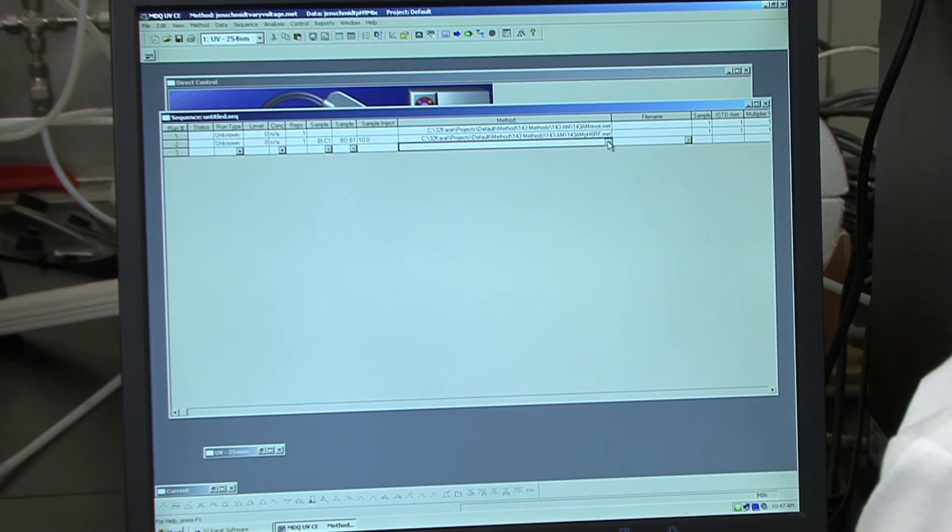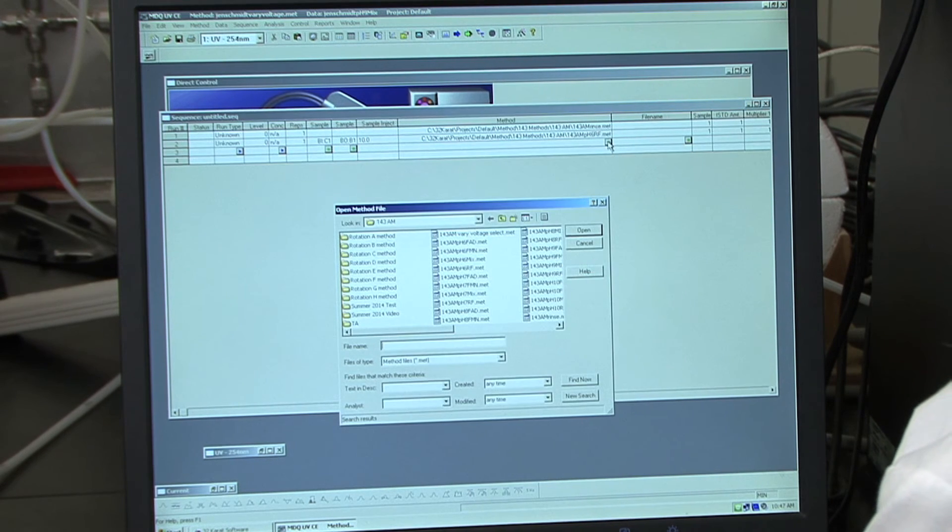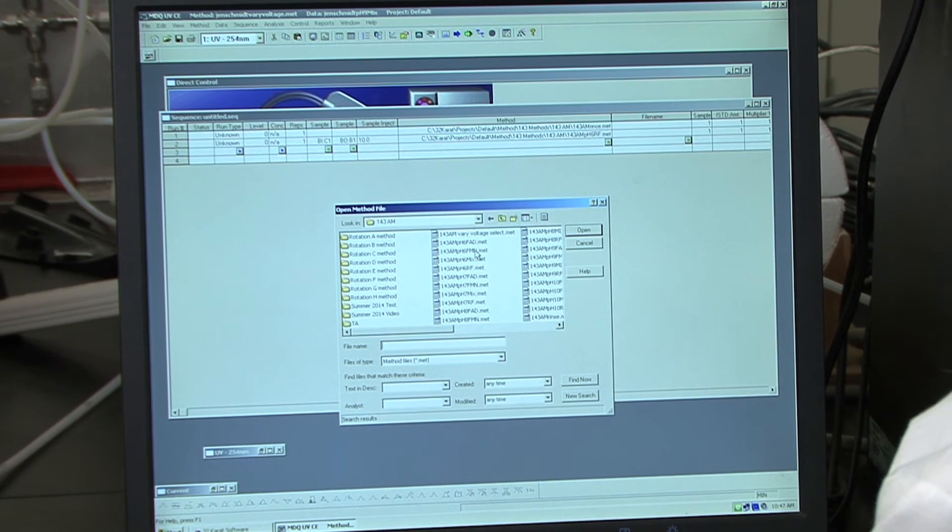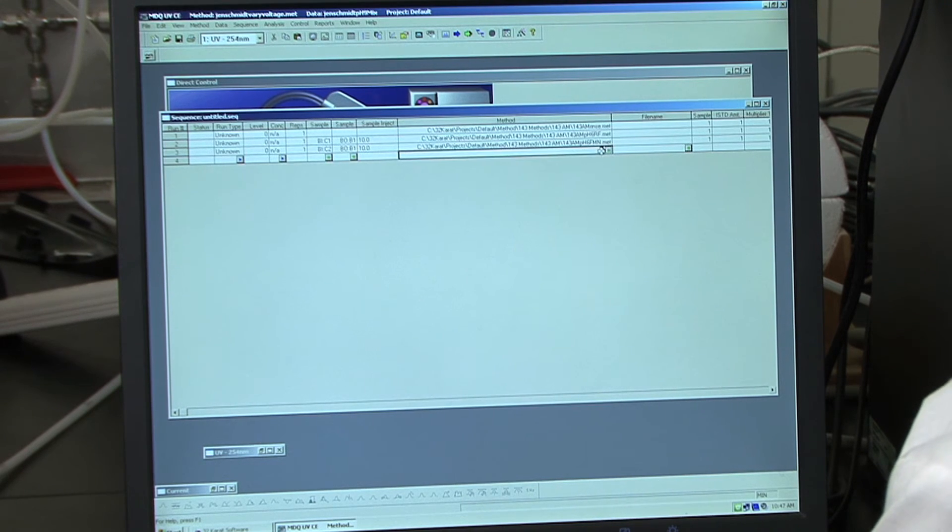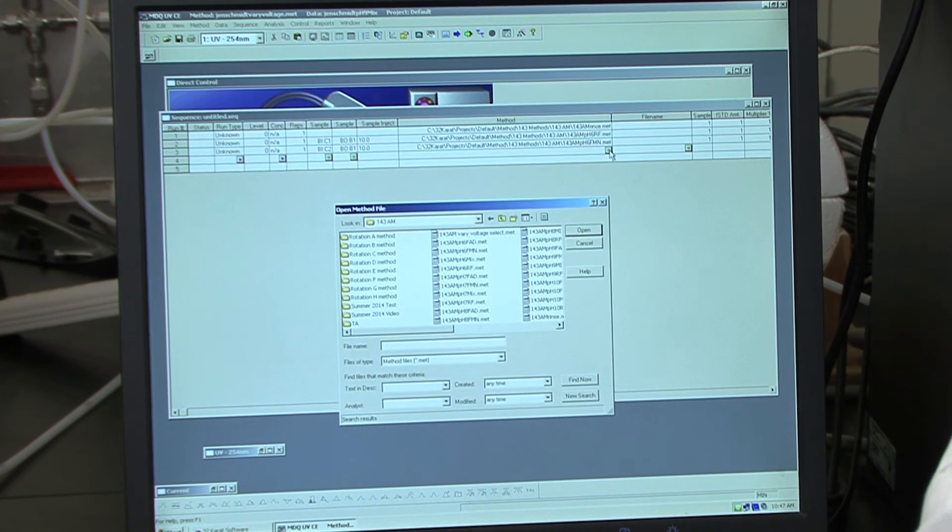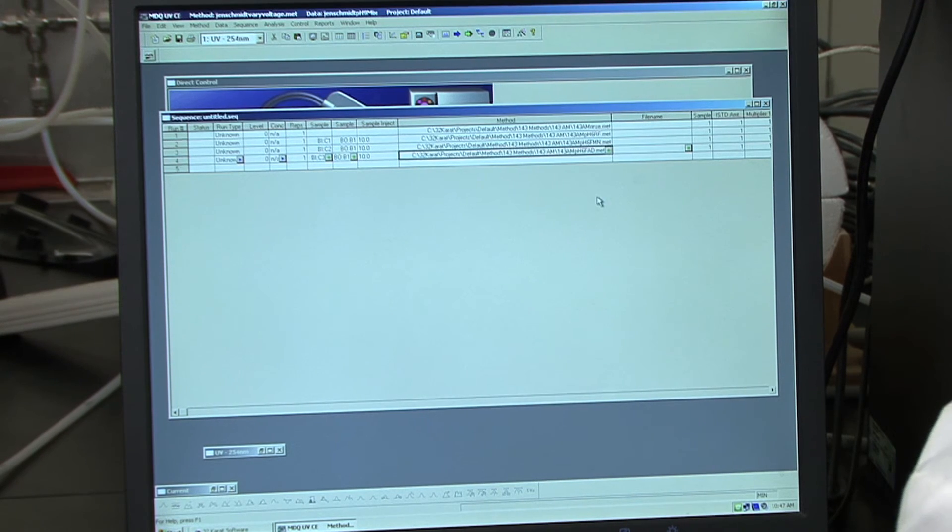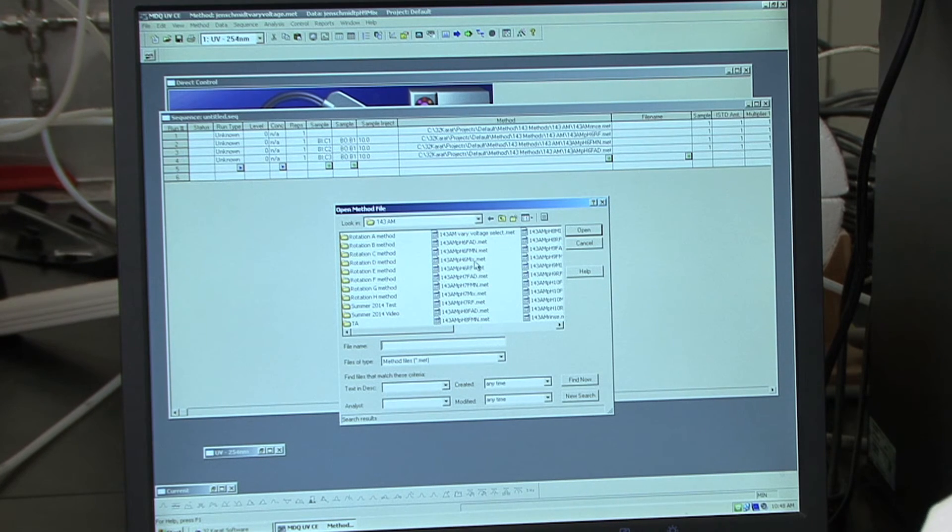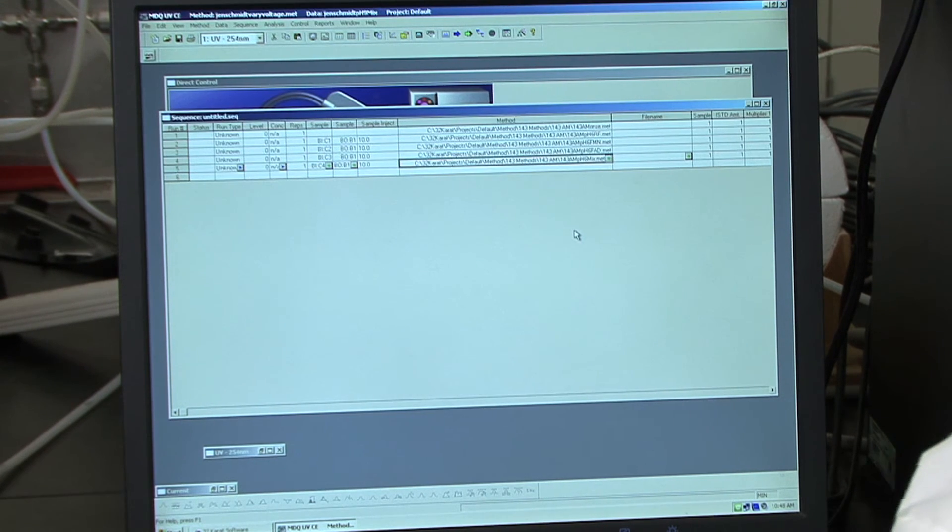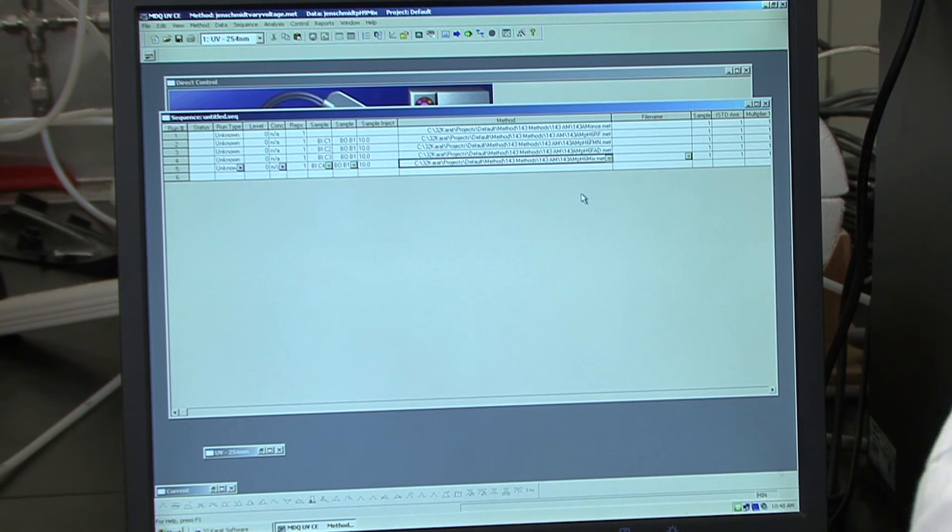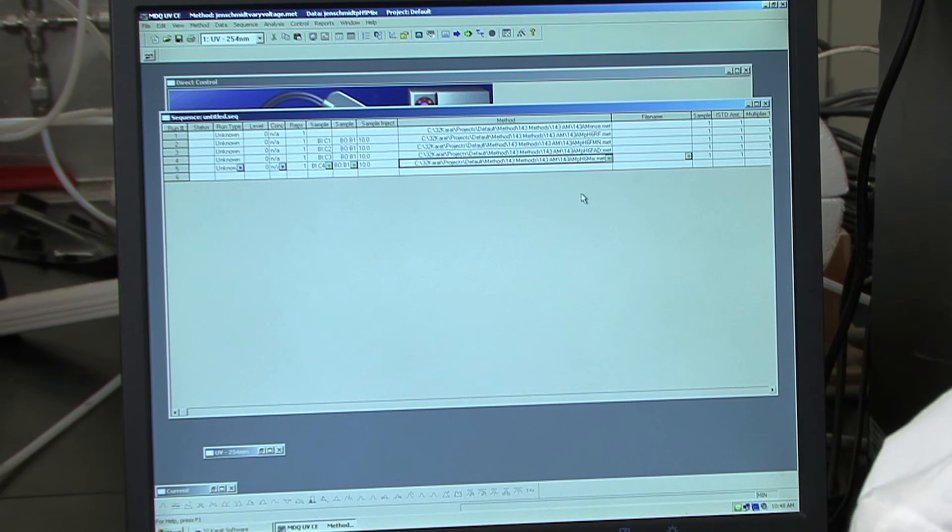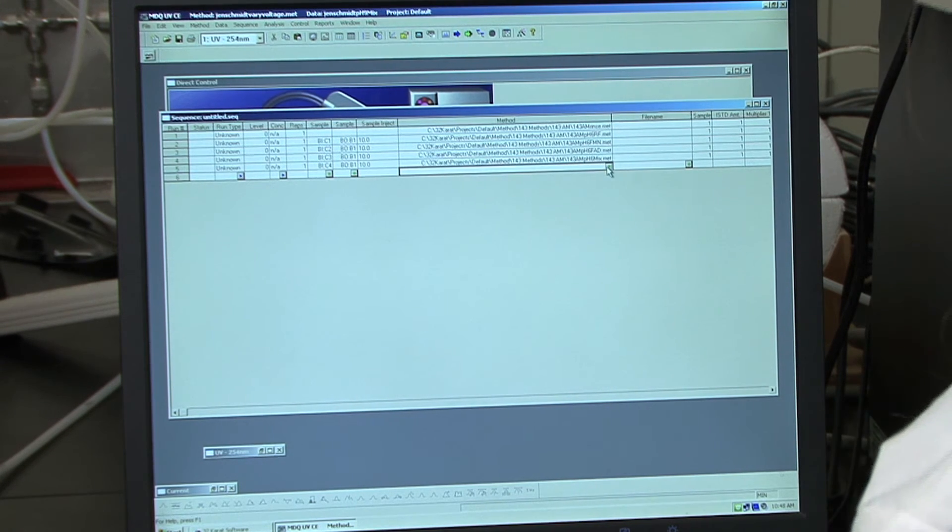The next one that we're going to load will be the FMN. Again, pH 6. You're going to load then the FAD. And the last one you will load for your pH 6 will be your mixture. When you are switching between pHs, you want to make sure that you inject a rinse sample. So next, I'm going to do a rinse.